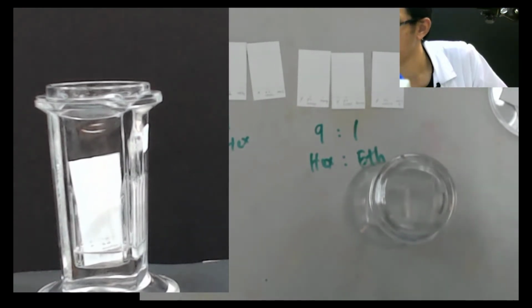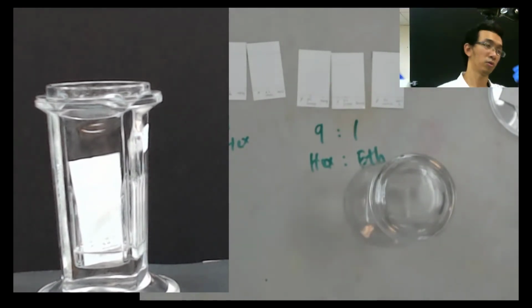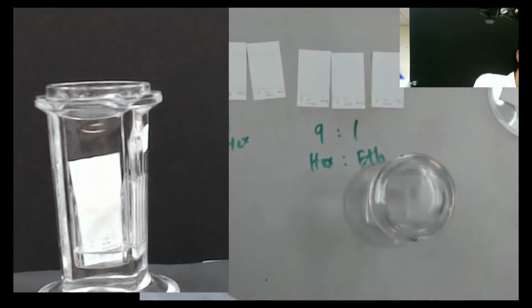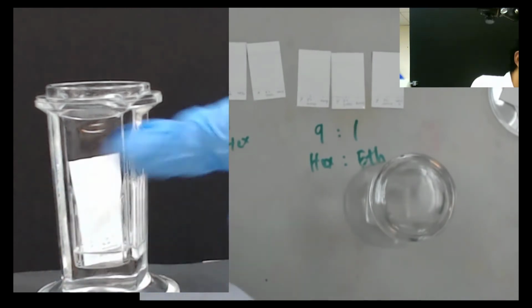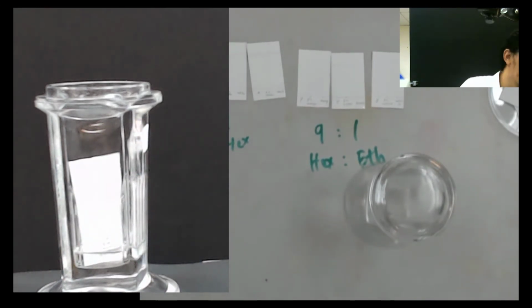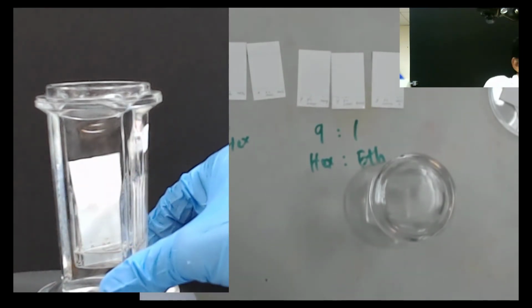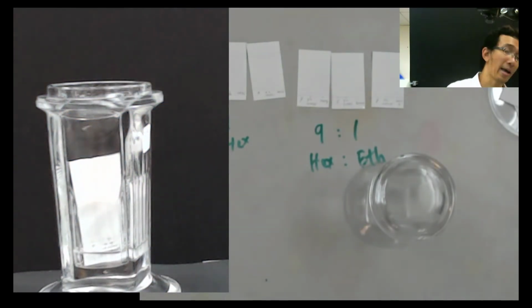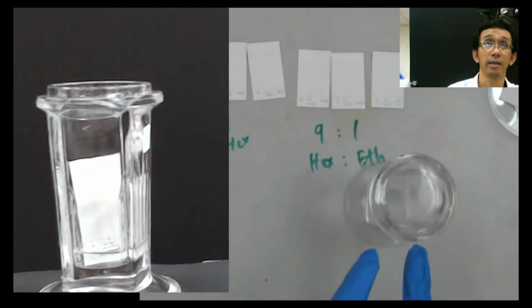Can you see? No, right? Because it's white and also white. This webcam has glass, this also glass, so there is reflection. So that's a problem no matter what. But later on, I will show you in front here what will happen.